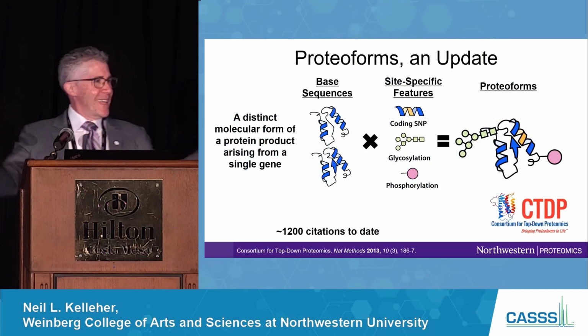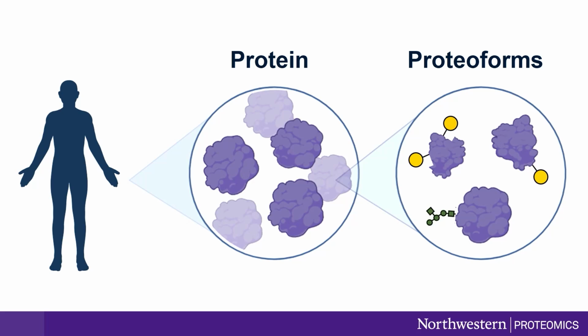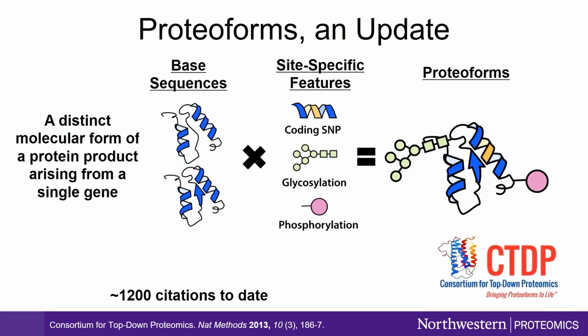And that's it. It's the sum. It's not that complicated. And let me go back to metabolomics as a field. Many of you are engaging with that field, right? You would never take a mixture of thousands of metabolites and start to disconnect the bonds between the atoms in those molecules as a mixture, and then get 20 or 30% of those atoms back and try to characterize the metabolites that were in that mix. That is describing bottom-up proteomics, right? So all we're saying here is meet biology where it's created. And I'll have tons of examples of these and the value proposition that derives from doing that.